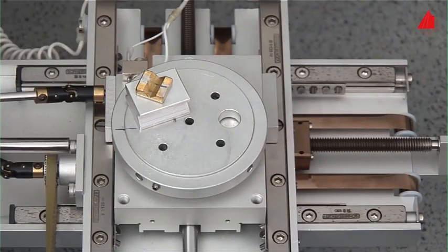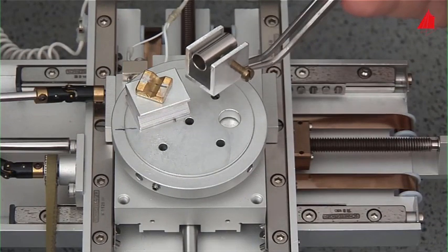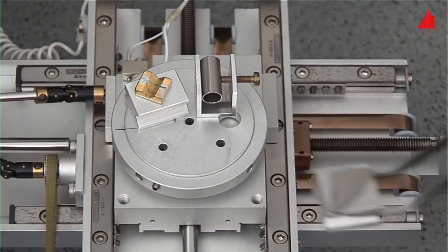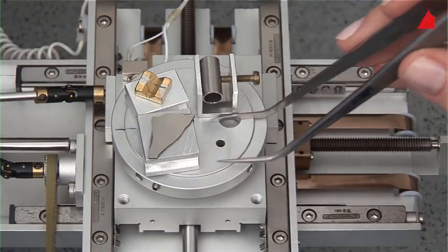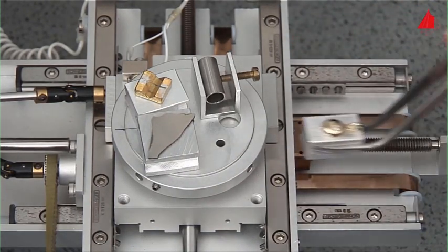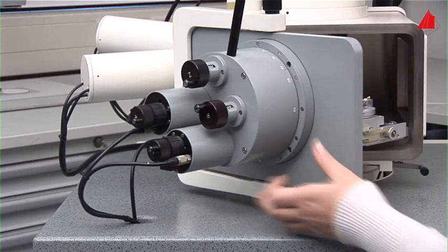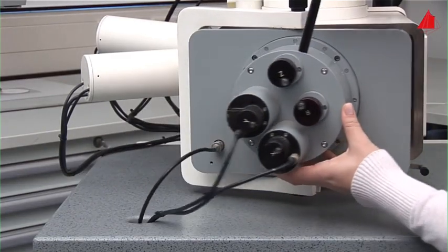The filament of an old used light bulb, part of a welded tube on a sample holder, a small cobalt plate, and a golden piece of jewelry. All specimens are assembled and we are ready to start. The material tester carefully closes the cover plate.